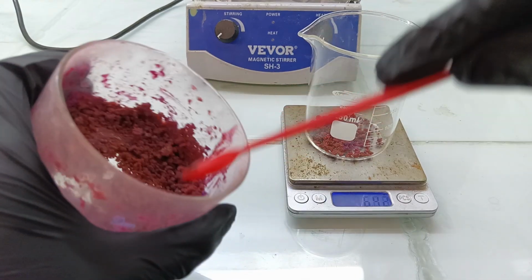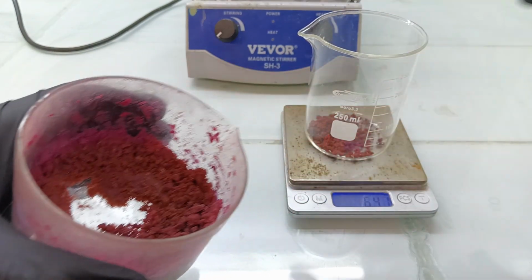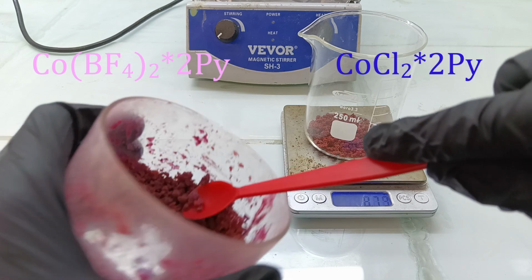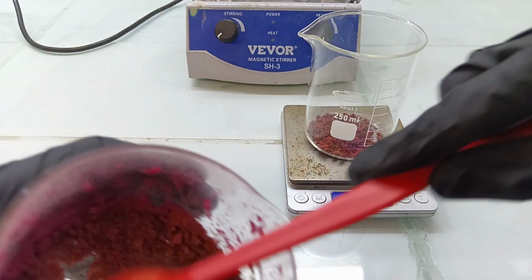Hello, today I'll be making various cobalt pyridine complexes. The first two are bis-Pyridine Cobalt Tetrafluoroborate and bis-Pyridine Cobalt Chloride. They are both fairly similar, so I'll combine some of the footage.